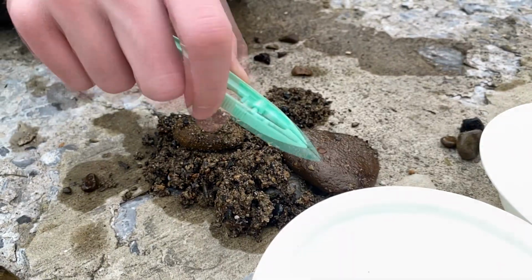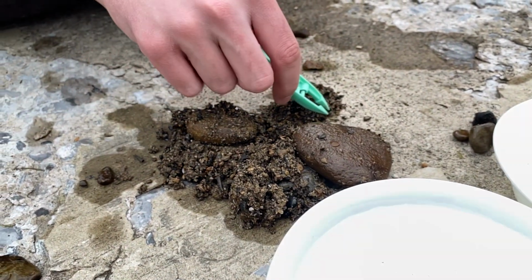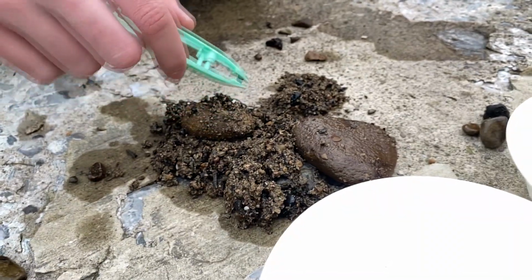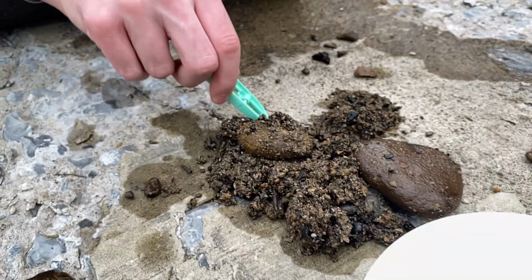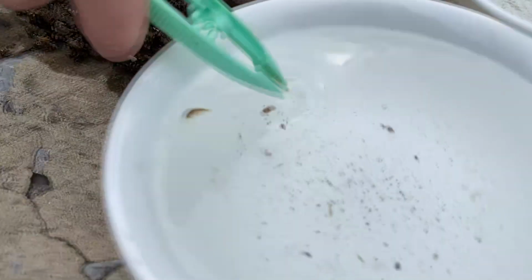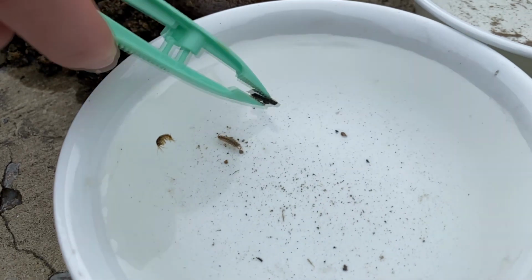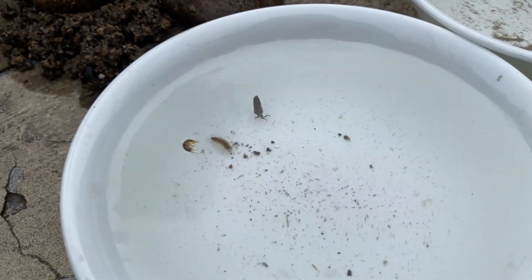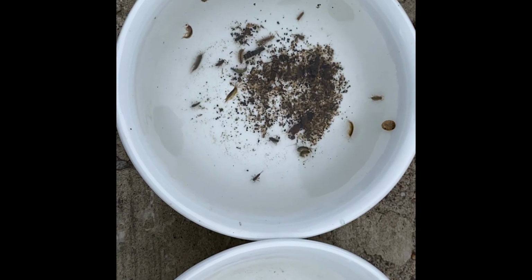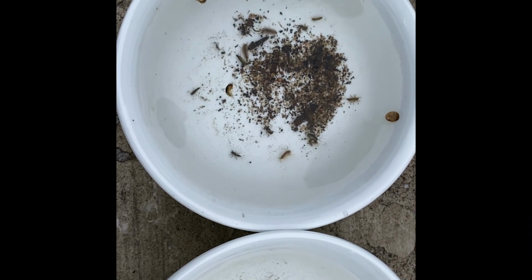Once you've dumped out your sediment, now what you're going to do is collect benthic macroinvertebrates. What you want to do is look for any form of movement and use your tweezers and gently grab them and deposit them right into the bowl. This is where you're going to place all of your benthic macroinvertebrates once you've collected them from your sediment sample.